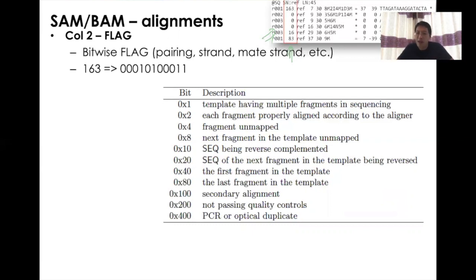Before we get into detail, I want to reassure you, this is just for your knowledge. Normally, we do not read these numbers. The machine has a program to read this, but the reason I want to present this to you is so you have a general idea of what information is being recorded in this particular number.